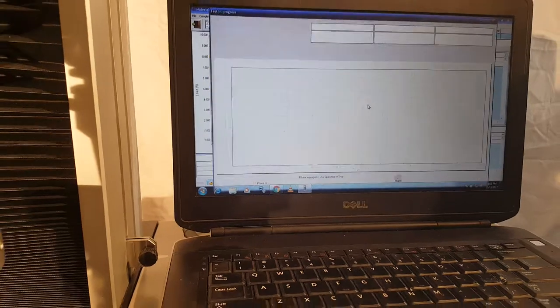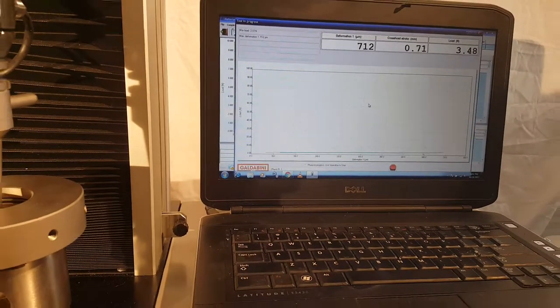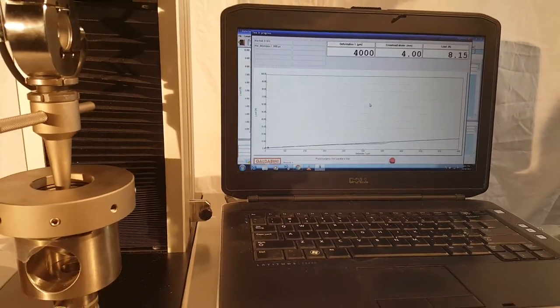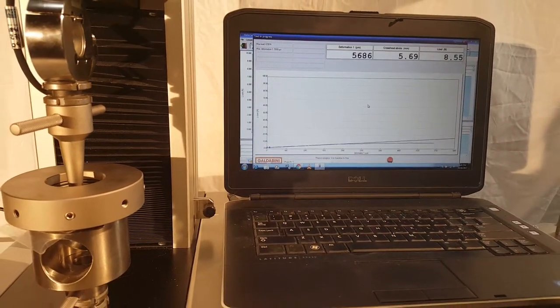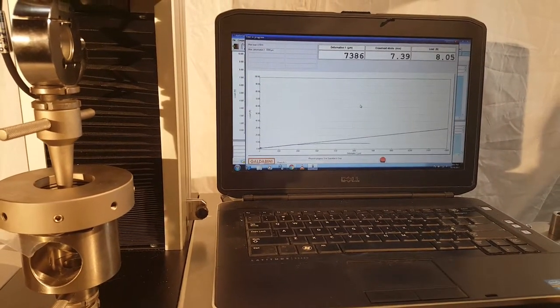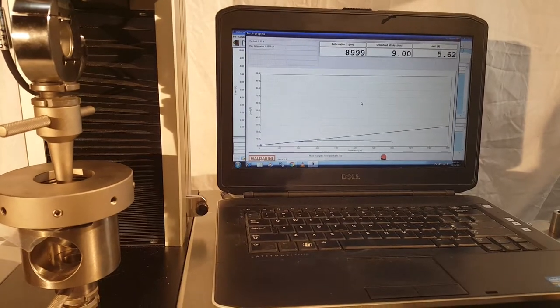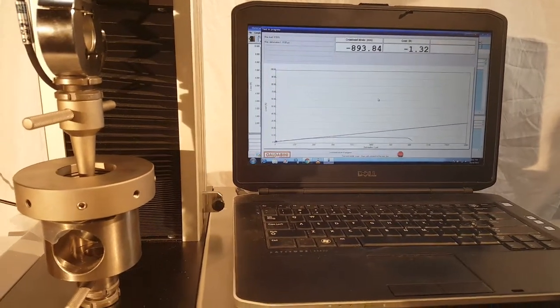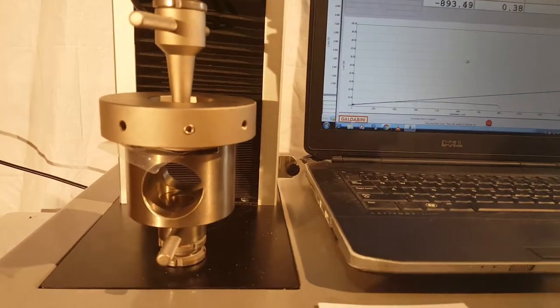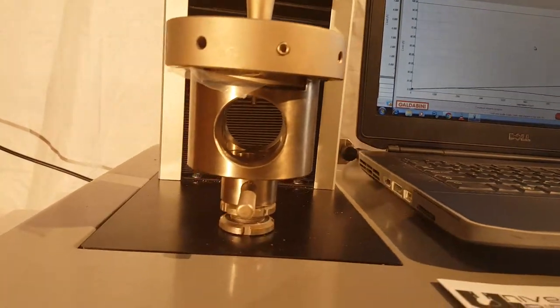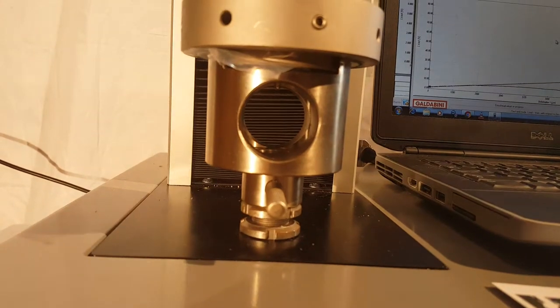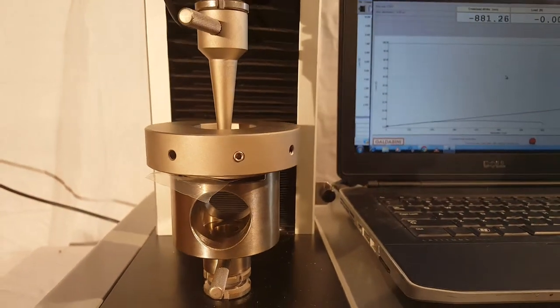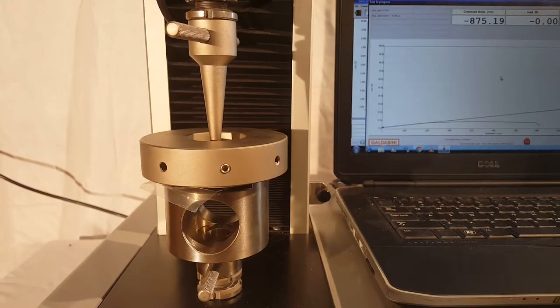Alright, we're pushing through the sample now. You can see the load curve building. And there we go. We've made a puncture through the bottom. The machine is returning to home.